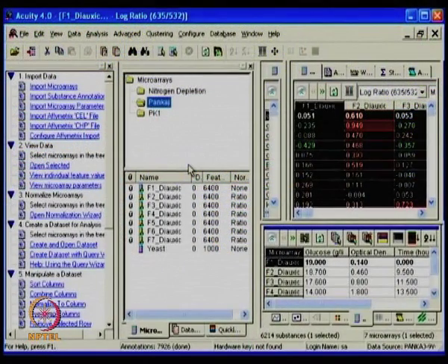As we described, we see first the import data tab. Basically this allows one to take the data from the microarray database and store it in the form of a GPR file and allow that to be understood by the Acuity software. We also have the opportunity of text file import, where you define what is available for what.